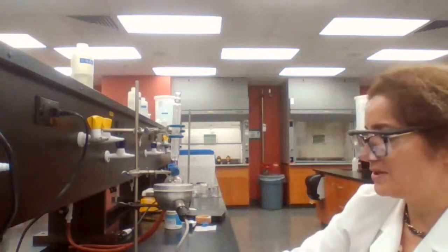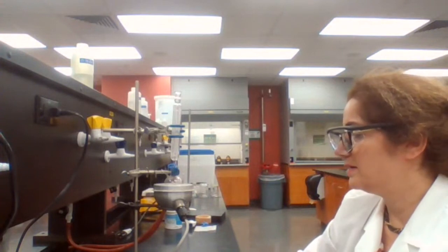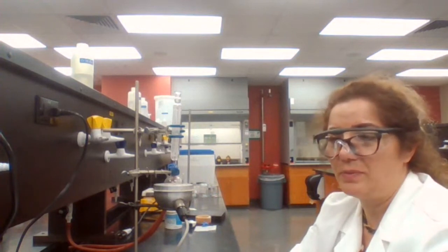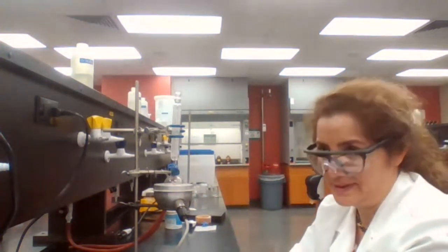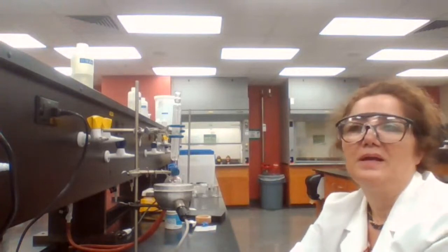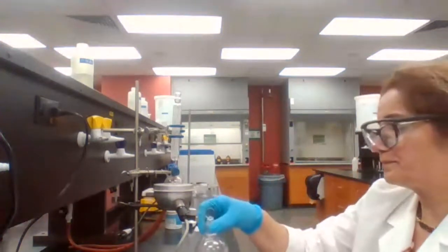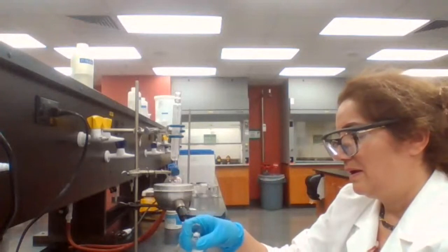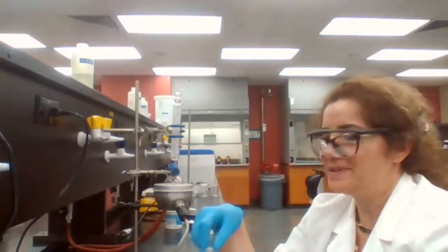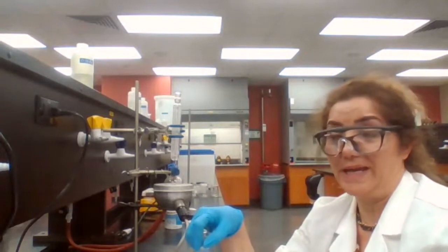The greater the number of extractions, the better the separation. Because the extraction is based on the partition coefficient, or the difference in solubility in the organic layer versus the other layer. So for this, let's say your compound is 90% soluble in the organic layer, 10% soluble in water or the aqueous layer.